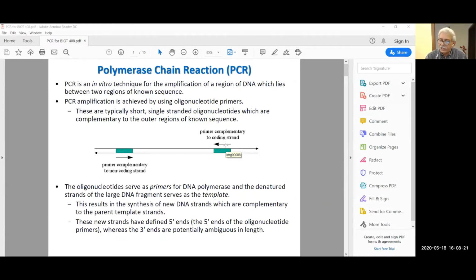One thing that I routinely mention to my students is that whenever you are thinking of setting up a PCR reaction, you must assure yourself that you are not going to be disturbed during this reaction. All the other research methods also require your complete attention. Okay? But here we are actually mixing 8 different ingredients into a tube. So what you do in the beginning, I will go to that step later on when I go to the individual ingredients of a PCR reaction.